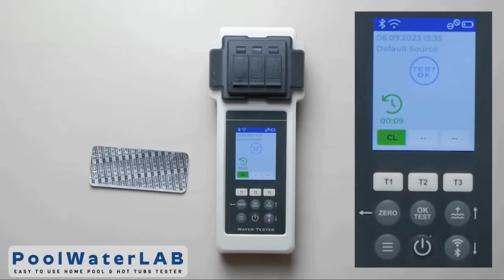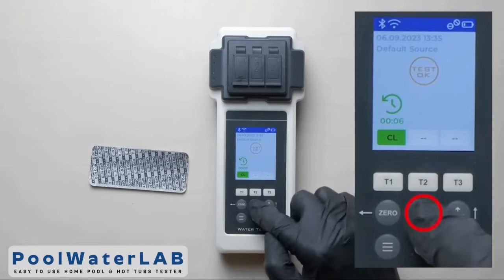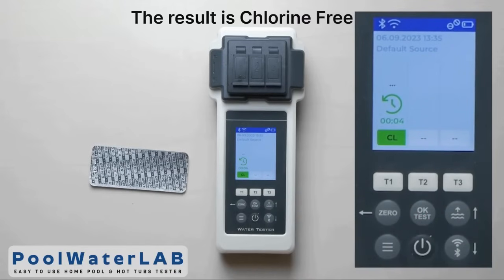Press the T1 button and click OK. Wait until the countdown ends and the test results of free chlorine appear.